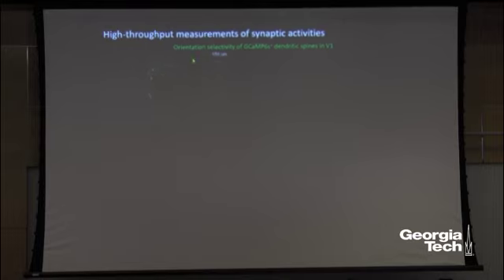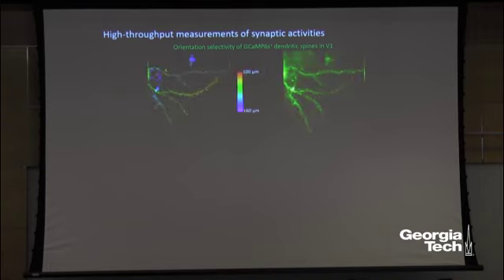So here is an example of what type of biological question you could use this method to answer. Going back to the visual cortex, say you want to know what the synaptic inputs onto an individual primary visual cortical neuron are, and what preferred orientation those inputs have. In a conventional way, you can see that this is what the dendrite looks like in 3 dimensions. It's very much a 3-dimensional structure. To image across a volume of only 60 micron, with the experimental protocol we are using, it's going to take 10 hours to do this experiment, which is just not practical in reality.